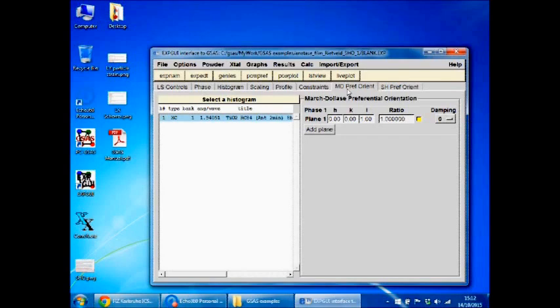So if you know that it's growing, say, just in the 101 direction, you can specify 101 and give it that ratio here to grow or not grow in that particular plane, and the other planes will obviously go down in growth subsequently.